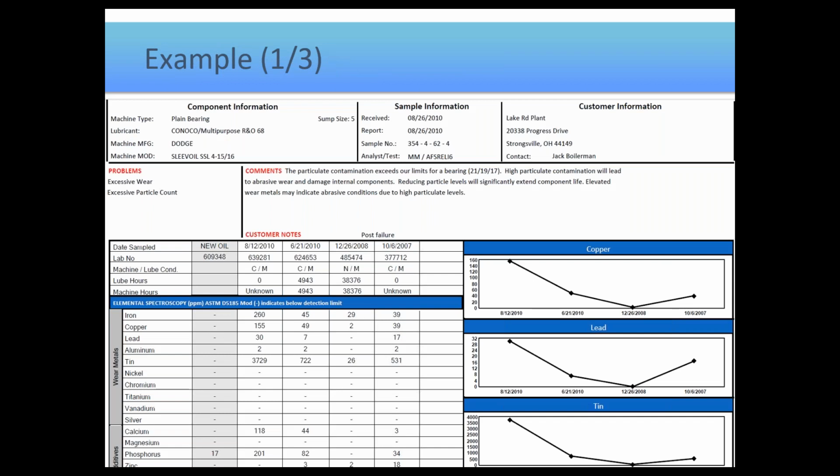So before we dive into this, I know some people listening probably don't know everything about a test oil report and its overall format. So let's cover a couple of quick things before we get into the actual reading of this report. First and foremost, just understand that when we do get down to the actual data on the report, this column here is labeled new oil. It is the baseline information for the type of oil identified just above the arrow. That is populated by people that send in oil samples. So when you send in an oil sample, you also send in a sample of that virgin product, unused, straight from the drum, tote, however you got it, as a baseline.